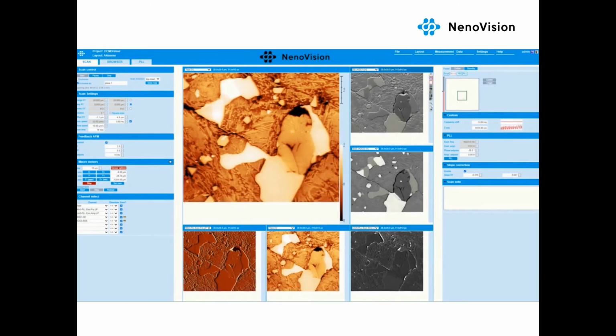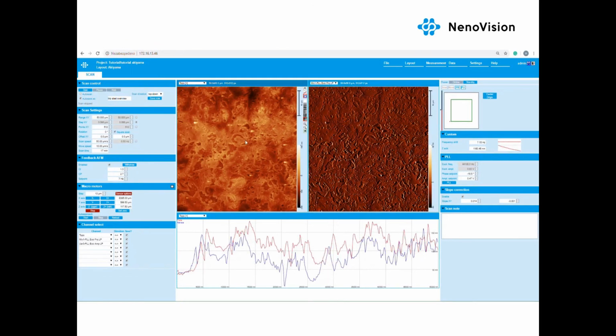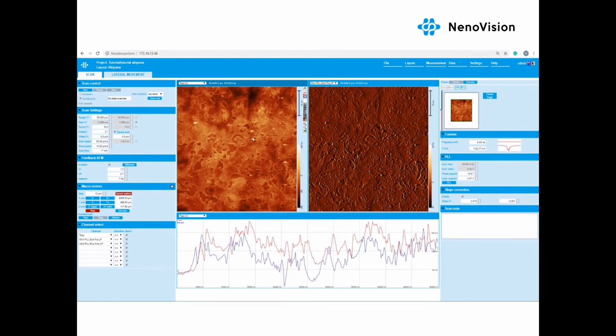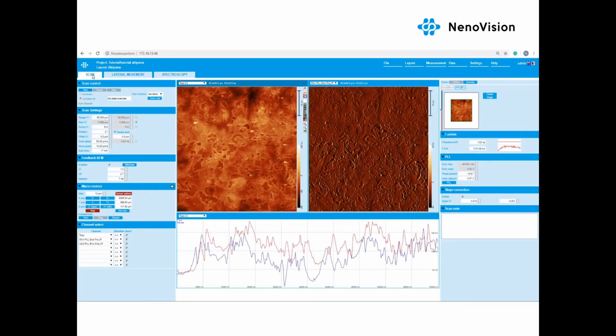When we return to our measurement, we can move the tip to the exact spot of the measured area thanks to the XY offset without retracting the tip. This way it is possible to measure, for instance, the force distance spectroscopy of the exact place. One of the other functions of NanoView is to choose the place in the obtained image.